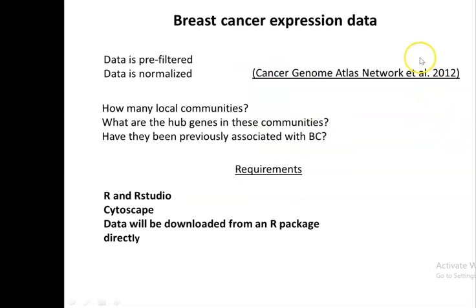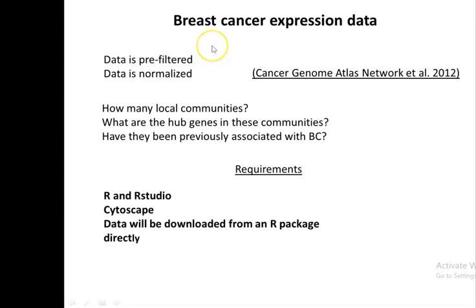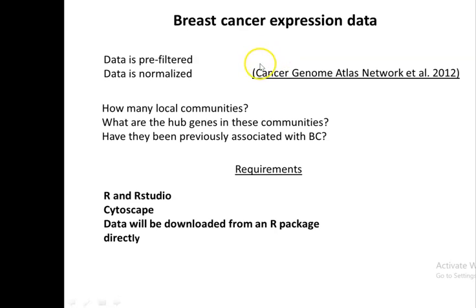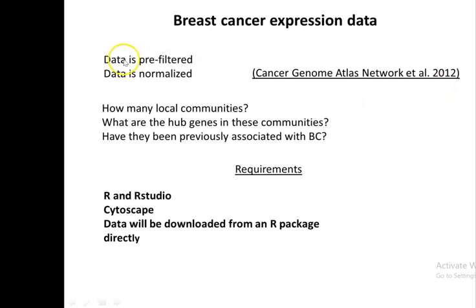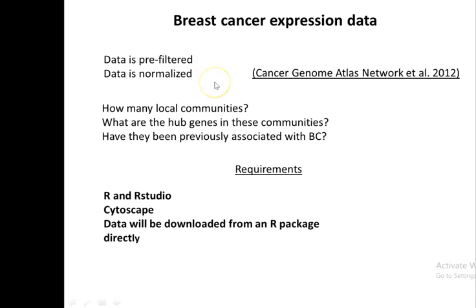Another thing that I wanted to mention: the type of data that we're going to work with is obtained from breast cancer samples. It is published in this study that I'm mentioning here from 2012. The data is pre-filtered and normalized, so it is ready to use already for the analysis that we are going to do.